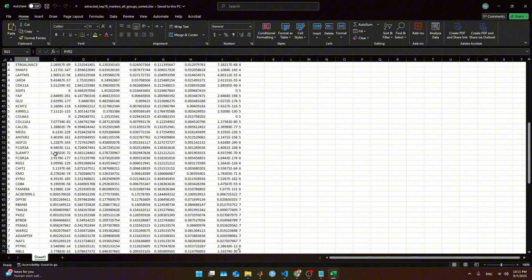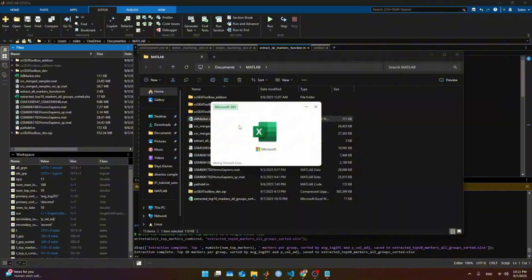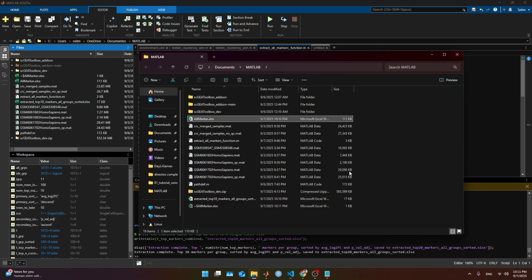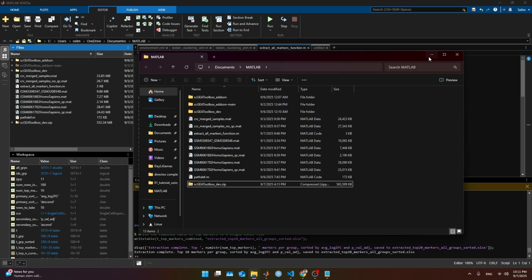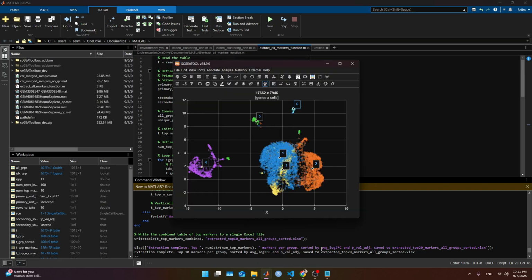Now I have something different than before, and I hope that makes it easier. Oh, wait a minute. This is not fine, because the all markers should be 6 clusters only. This is not right. Let's erase it. We gotta be sure that whatever we find is the same as we had before.